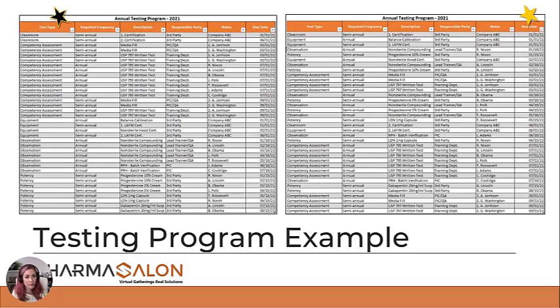We have the second media fill, because we want to do that semi-annually if we're doing high-risk compounding. We've got our equipment, calibrations, and certifications. Observations that we want to do annually for our non-sterile compounding technicians. I've got listed in here some pharmacist observations. And then potency testing. So this is where we would list all those formulas that we decided to put into our testing program based on our evaluation of our data that we did.